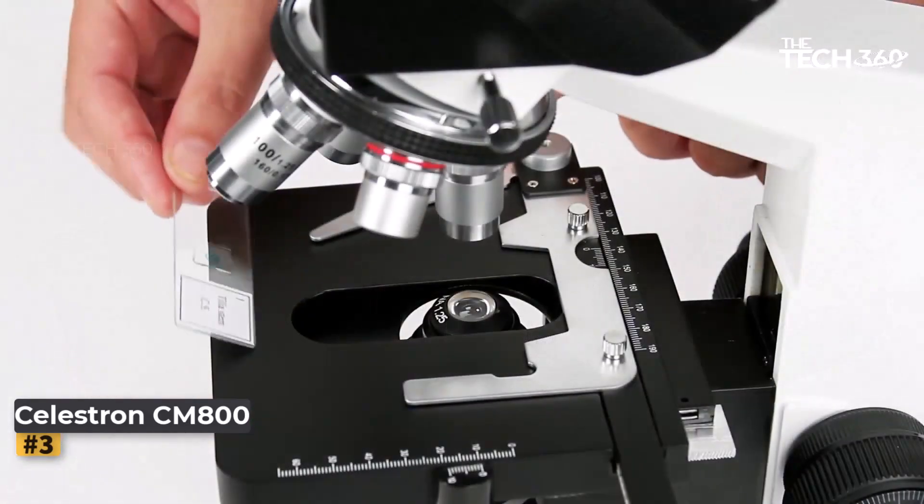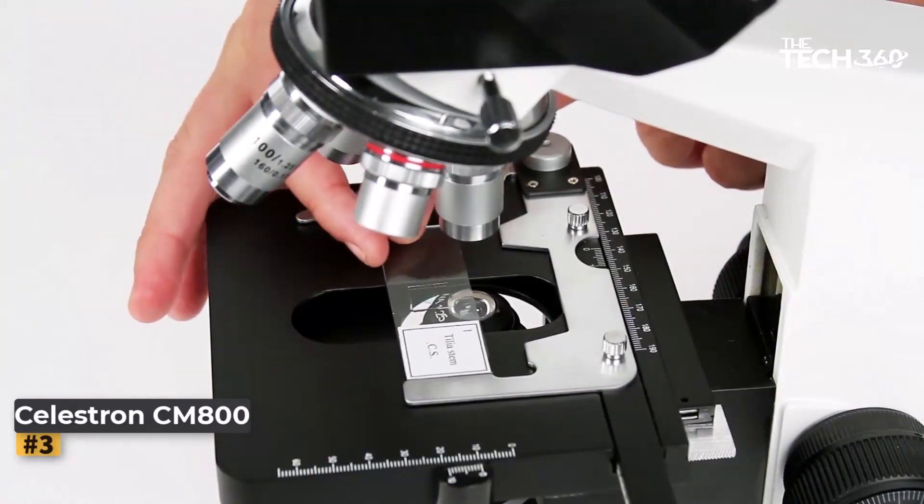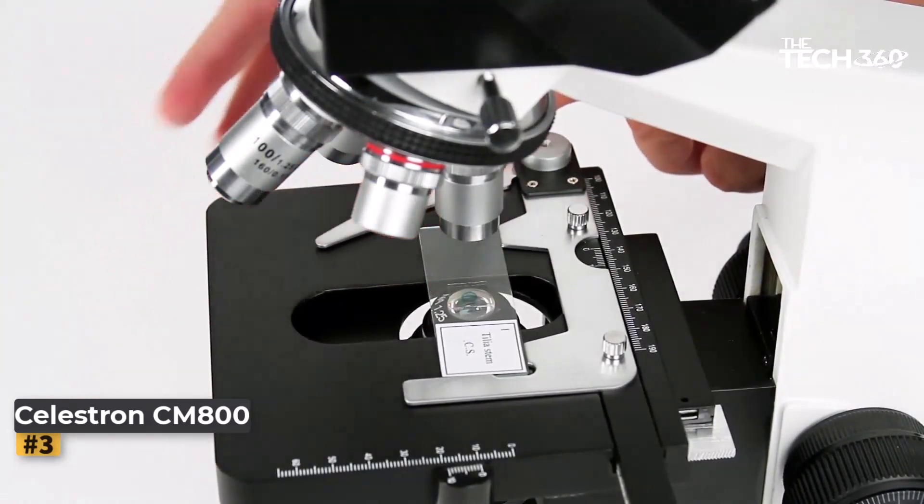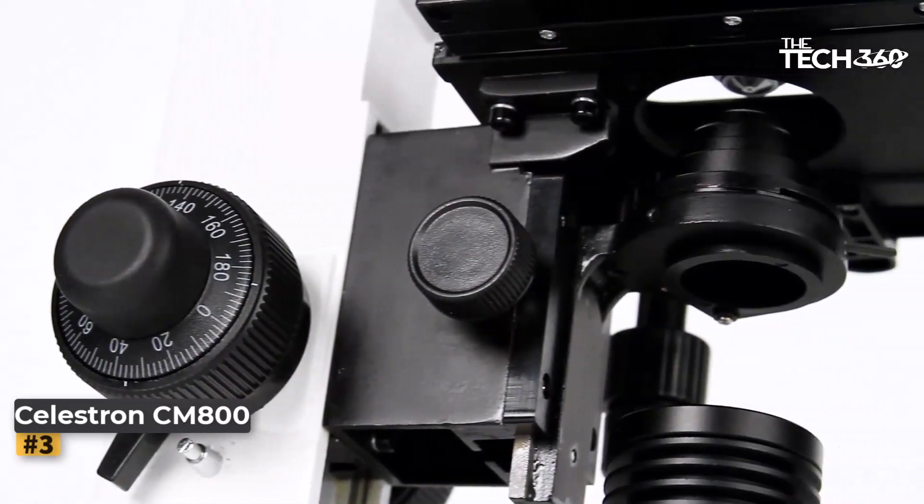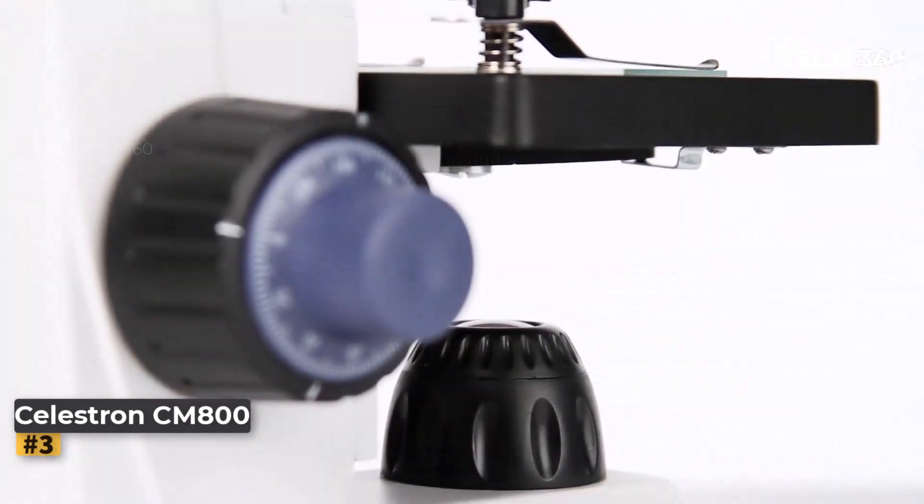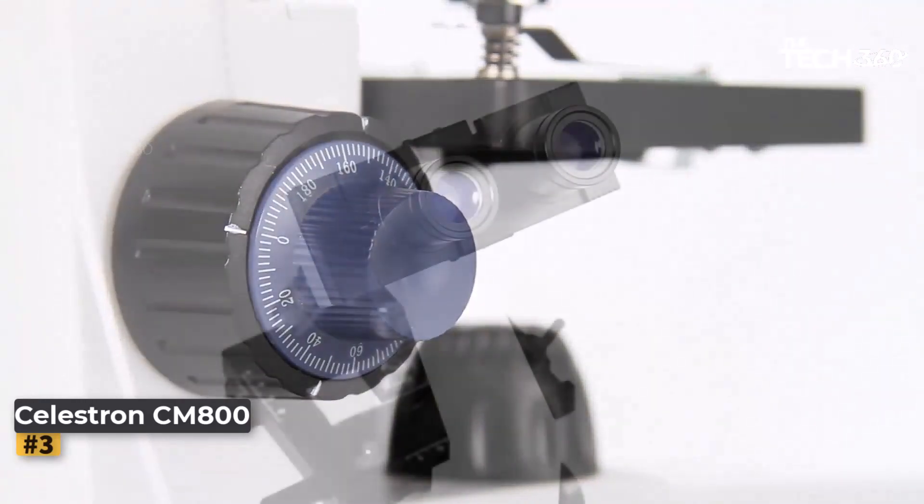The built-in LED illumination can be adjusted, and the microscope can be powered by batteries, making it suitable for field use. With its ease of use and durability, the Celestron CM800 is a reliable companion for both in-classroom and outdoor observations.